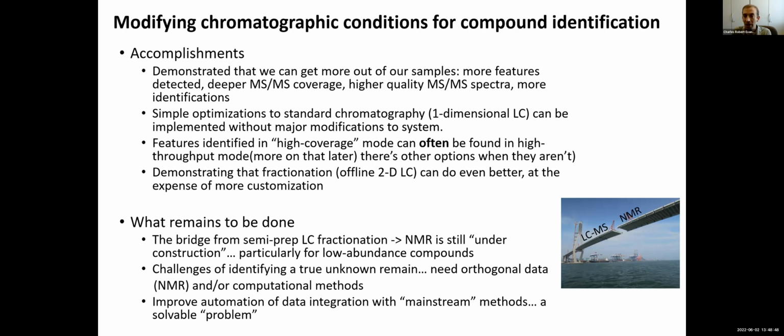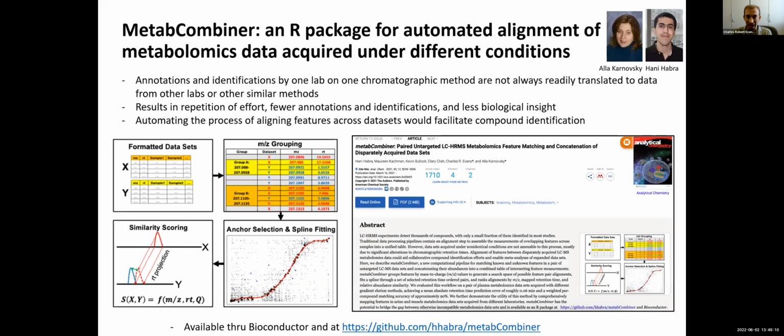If we ever want to see this adopted, we need to demonstrate that this can be done by an average or at least an LC-savvy lab without too much difficulty and without too much expense in terms of time, beyond what you might already be spending trying to identify samples in the data analysis workflow, which we posit really occupies the vast majority of the time.